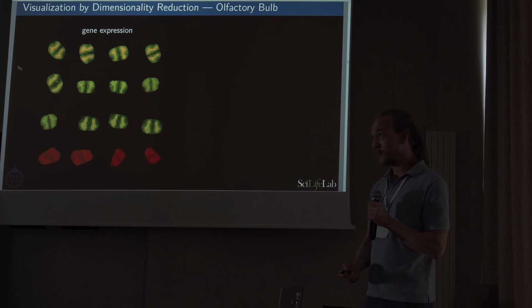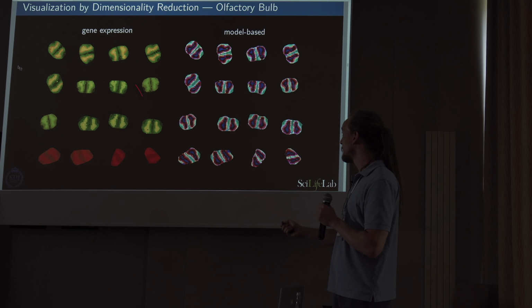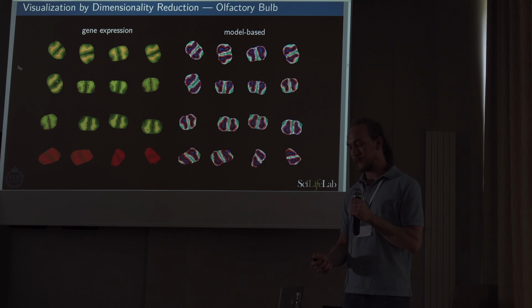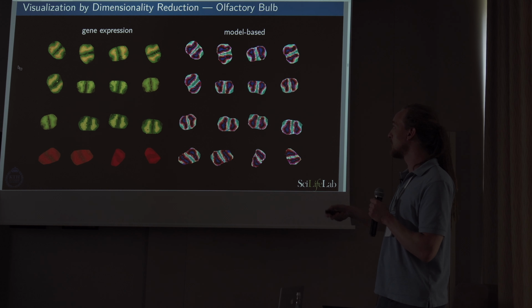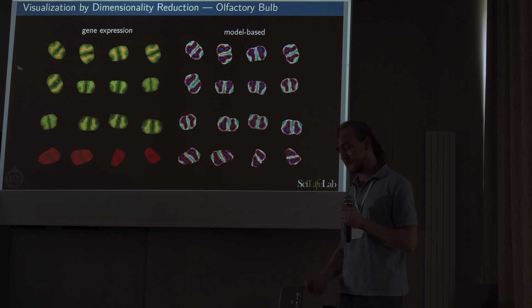Yeah, and in the remainder of the talk, I would like to explain how you go from this here to that, in which I hope to convince you that we will be able to successfully address these batch effects so as to achieve a consistent colorization between corresponding spots in multiple samples.